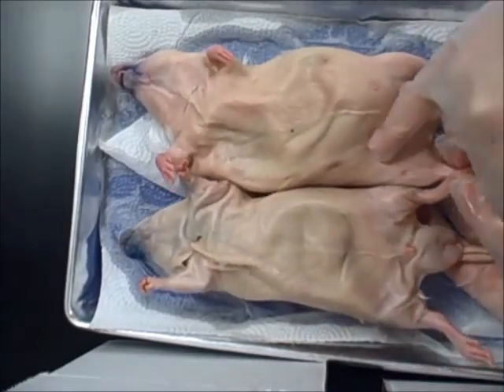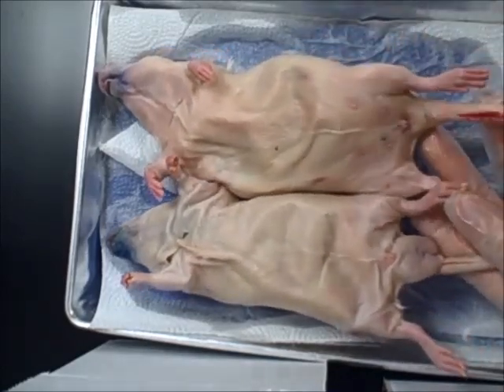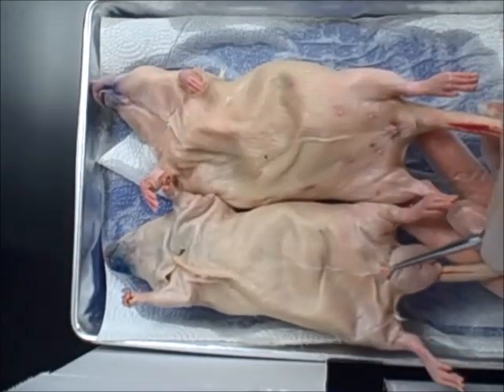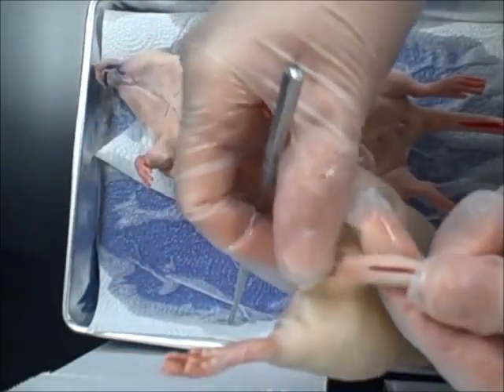Both male and female have the mammary papilla. The female ones are a little more obvious. Both male and female have the urogenital opening, where the urethra sends urine out of the body. Under the tail, they both have an anal opening.